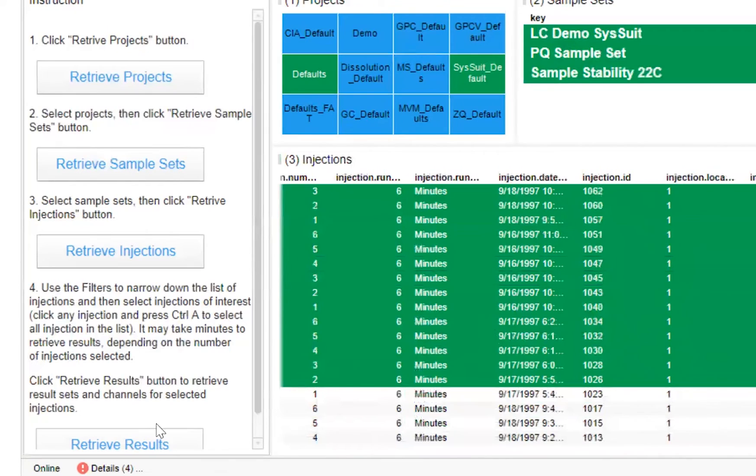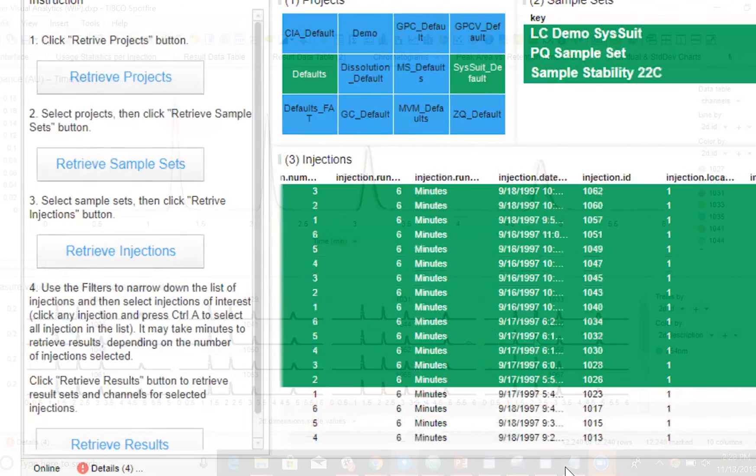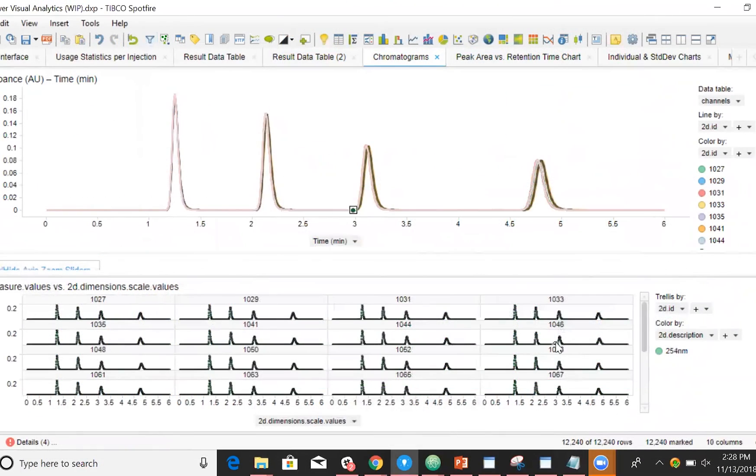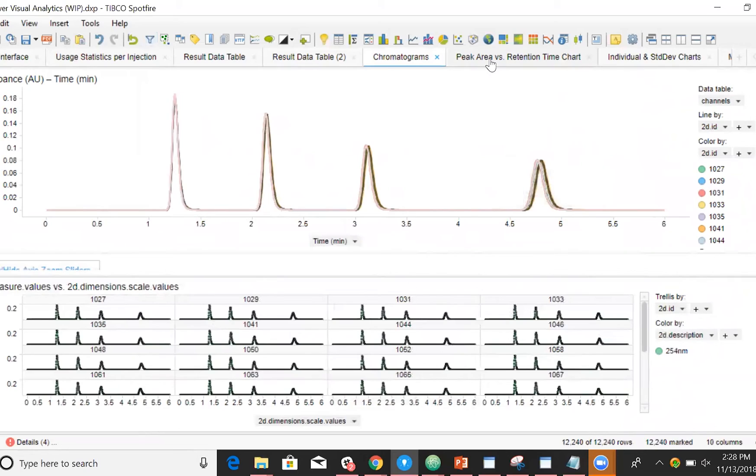We can retrieve results for injections, giving us peak tables and chromatograms. We'll even be able to build some aggregate visualizations in order to perform more complex analysis and gain even more insights into our experiments.